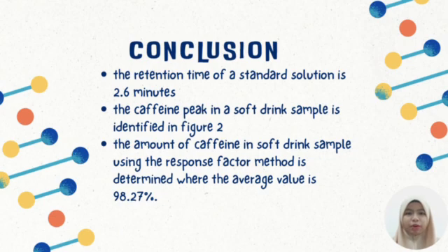The retention time of the standard solution is 2.6 minutes. Next, the caffeine peak in a soft drink sample is identified in Figure 2. And lastly, the amount of caffeine in a soft drink sample using the response factor method is determined, where the average value is 98.27%. That's all from us.